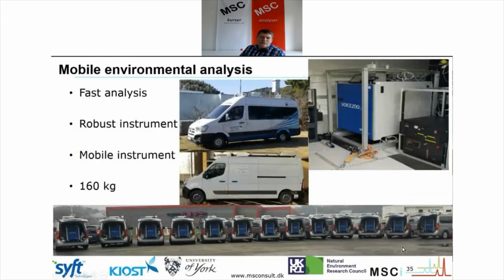Another thing is that it's a really nice and robust instrument, and actually some people, like the University of York and KIOST, which is an institute in Korea, are driving around doing online measurements using a Syft-MS.